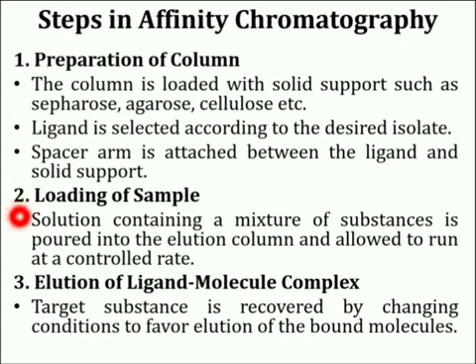Second step is loading of sample. In this, solution containing a mixture of substances is poured into the column and allowed to run at a controlled rate. Target substances bind specifically but reversibly to the ligand and unbound material washes through the column.